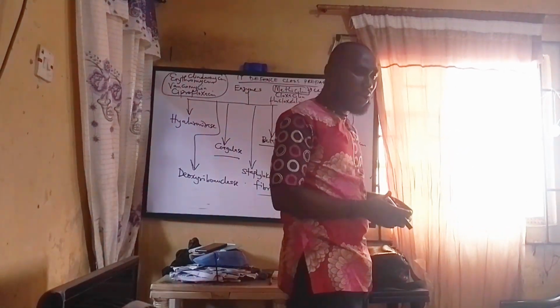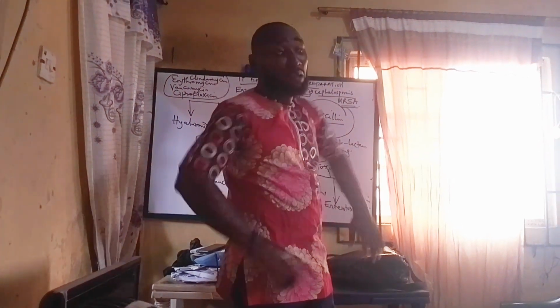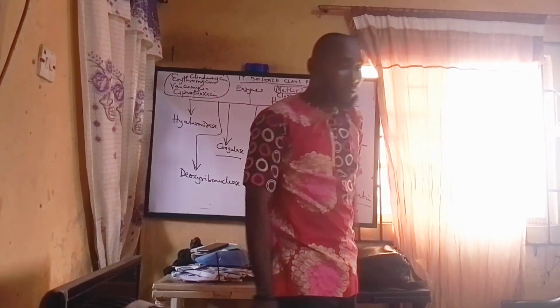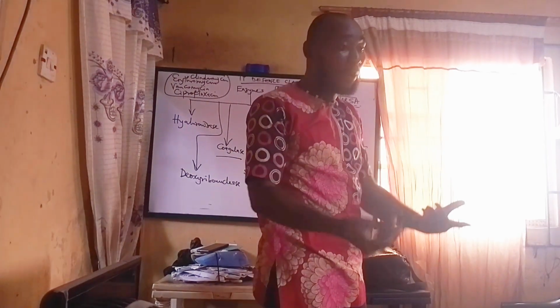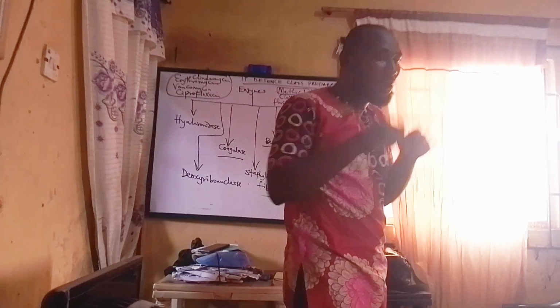Then when you do culture, you saw strains of staphylococcus, but you're not sure. Don't tell them it's aureus. They will ask you, how did you know it's aureus? That is when you tell them that you did a biochemical test. Then you are seeing strains of staph and strep, but you're not sure, so you now did a biochemical test. What is that biochemical test? Catalase test. Because staph is catalase what? Positive.